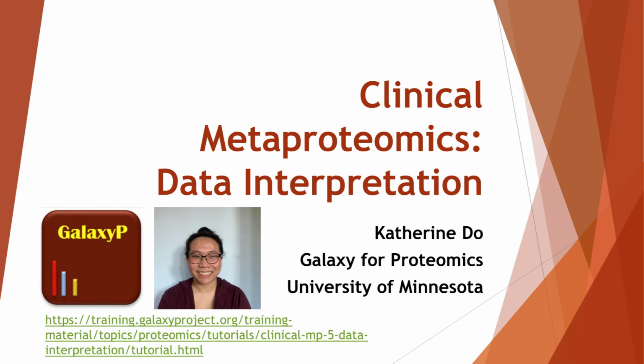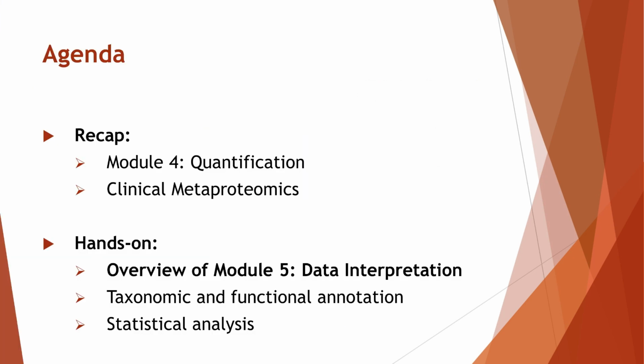Now, let's begin. First, we will summarize the quantification module and how it set us up for this module. Then, in the hands-on section, we will execute the data interpretation workflow, where we will perform taxonomic and functional annotation using Unipept, followed by statistical analysis using MSstatsTMT.